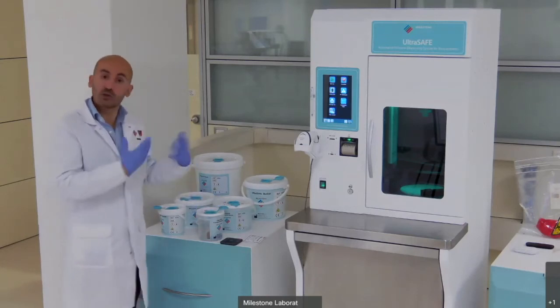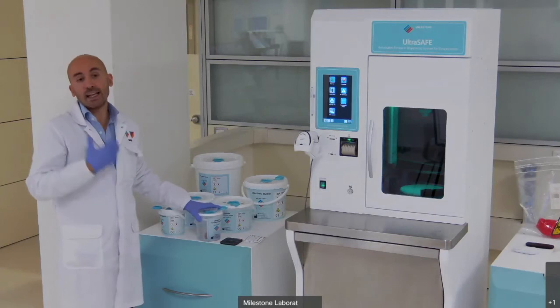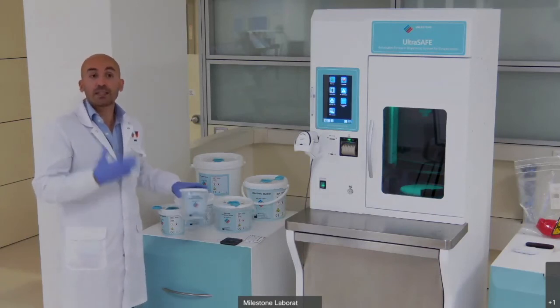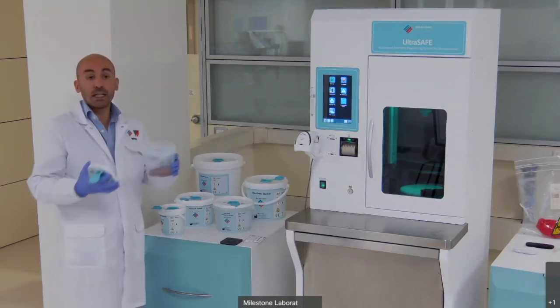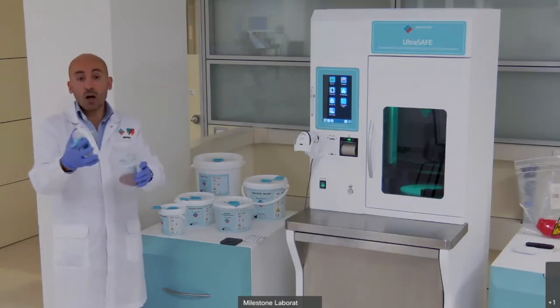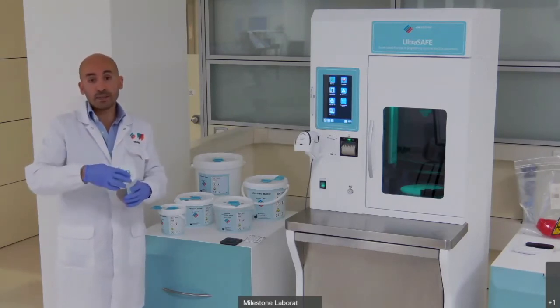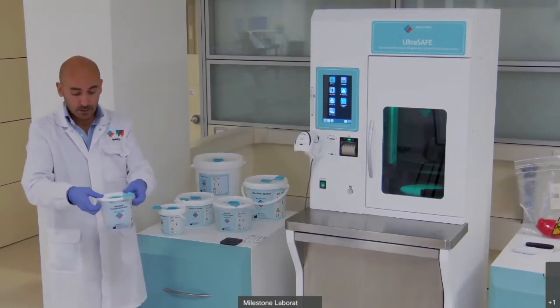In order to introduce the practical part, I will now simulate that I am the operator, and we see a surgical piece in the surgery room. Now I receive the specimen and close the cover here.